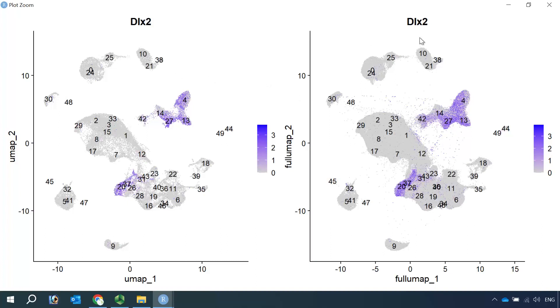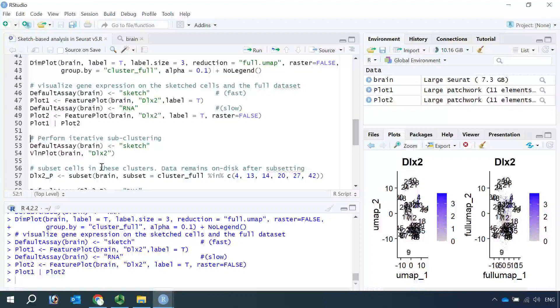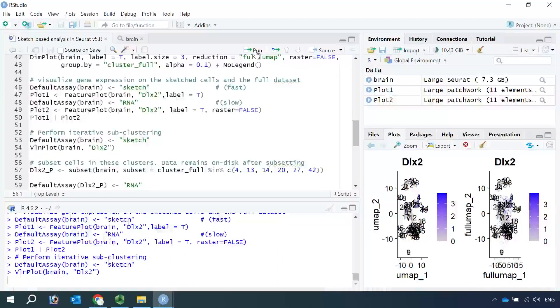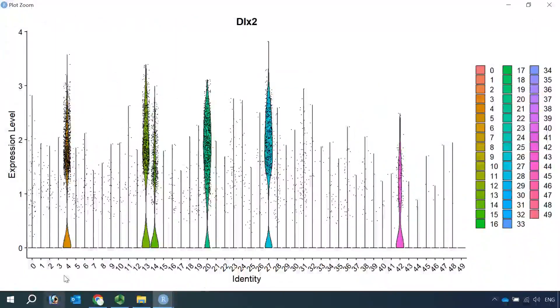So let's subset the DLX2-positive cells, then we can perform further analysis for DLX2-positive cells. We can use the violin plot to see more clearly which cell clusters express DLX2. We can use the sketch assay to run the violin plot, because it is much quicker using the sketch assay. So let's switch the default assay back to sketch and run the violin plot for DLX2. Let's zoom in. You can see clusters 4, 13, 14, 20, 27, and 42 express high levels of DLX2.